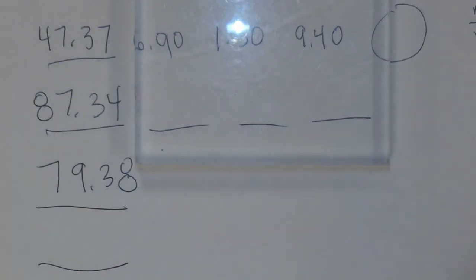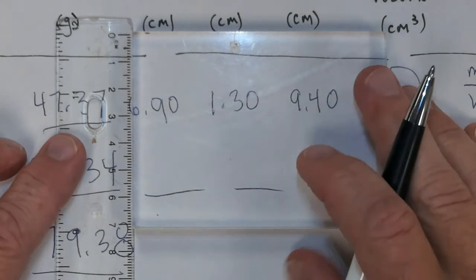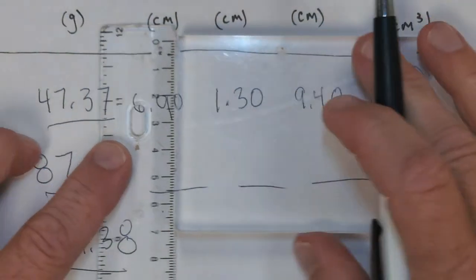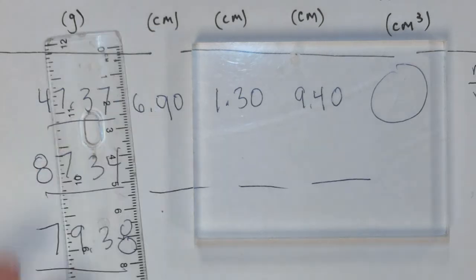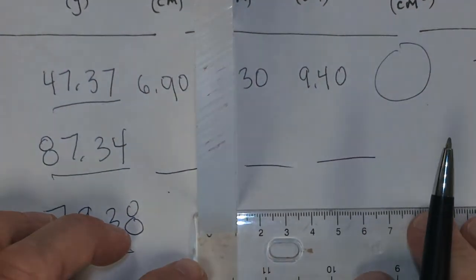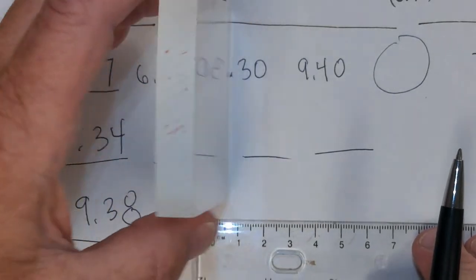Okay, here's the width now. 0 right there. So you should be able to see the measurement. Well, let me move it to a place where there's no lines there. There you go, see the measurement right here. And now I got to do the height. Whoops, that doesn't look very good.